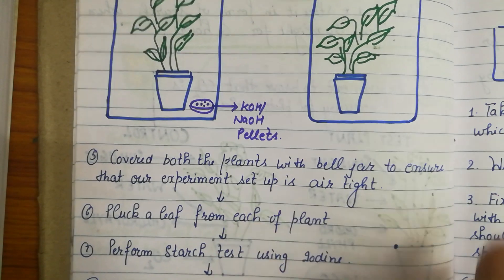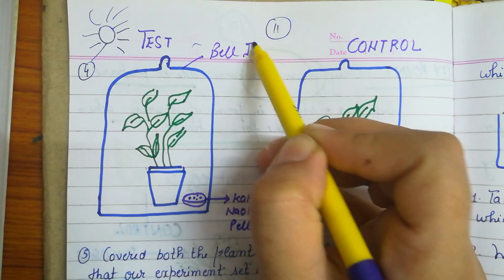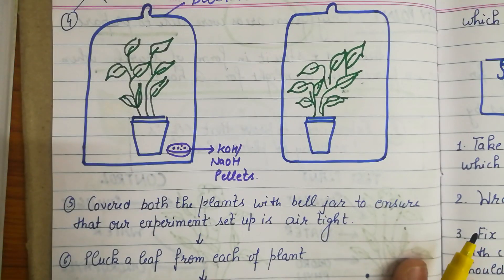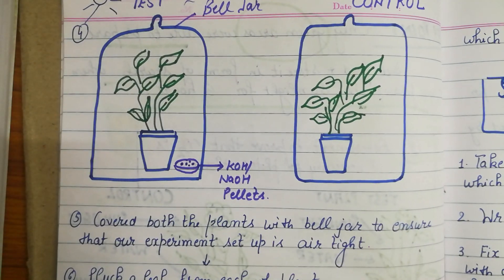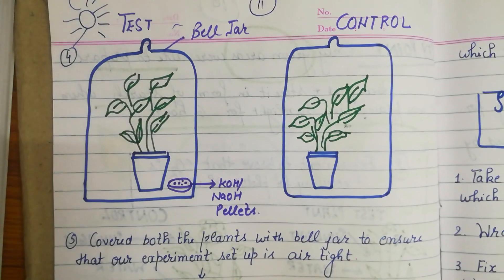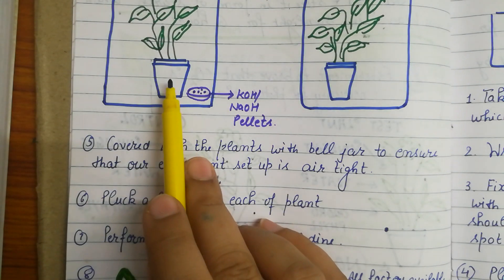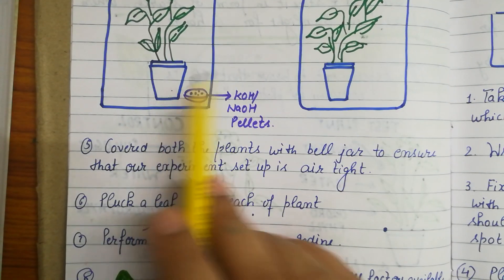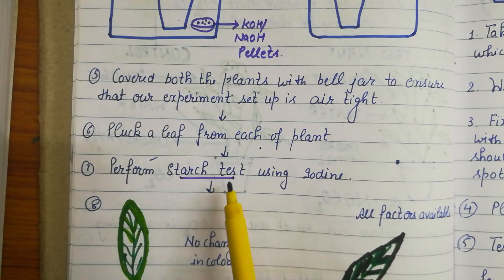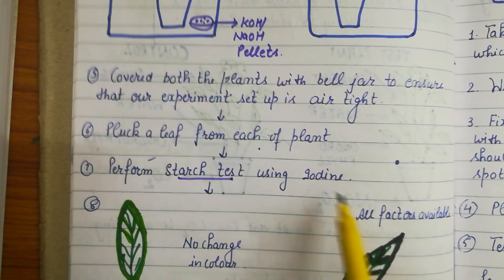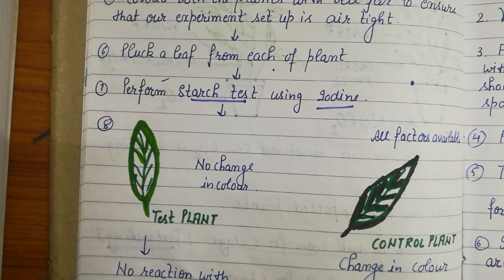Cover both the plants with a bell jar to ensure that our experiment setup is airtight. In the next step, pluck a leaf from each plant — from both the test and control plant — and perform the starch test. As you know, the starch test is performed using iodine solution.